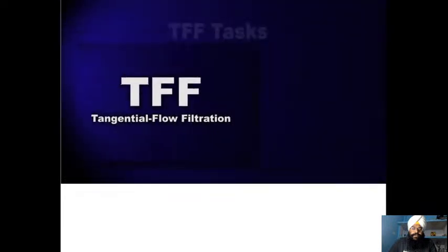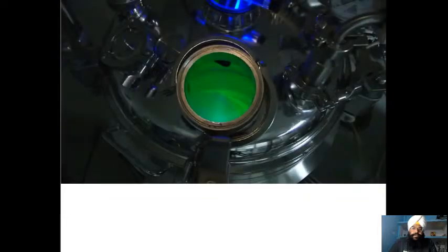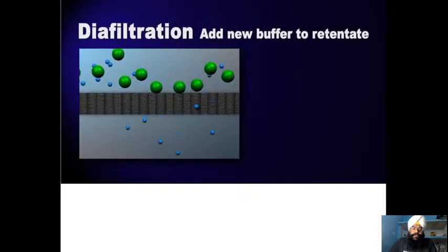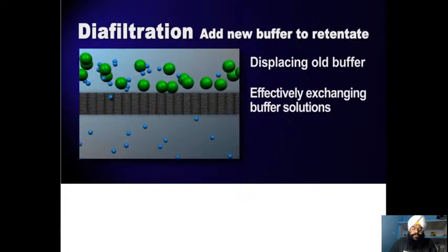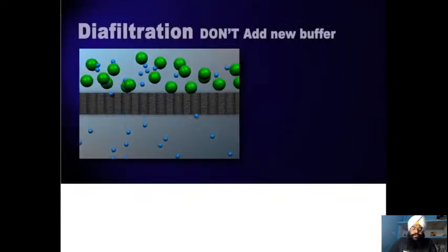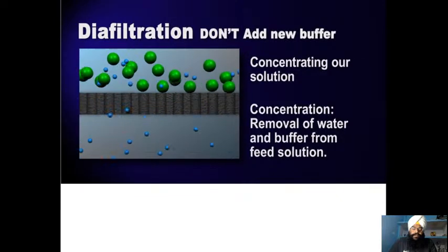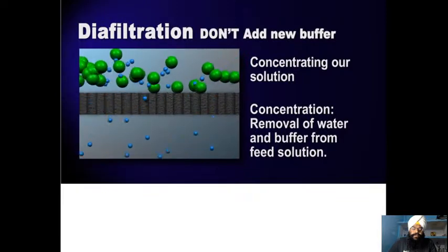We'll be using TFF for two different tasks within the purification process: concentration and diafiltration. We are processing purified GFP from a chromatography step. The fluid from the chromatography step is purified green fluorescent protein dissolved in a buffering solution. In diafiltration, we add new buffer to the GFP retentate while displacing the old buffer, effectively exchanging buffer solutions. Note, the GFP is retained by the membrane. If we don't add a new buffer, then we're concentrating our solution. Concentration is simply the removal of water and buffer components from the feed solution that results in a more concentrated solution of green fluorescent protein.